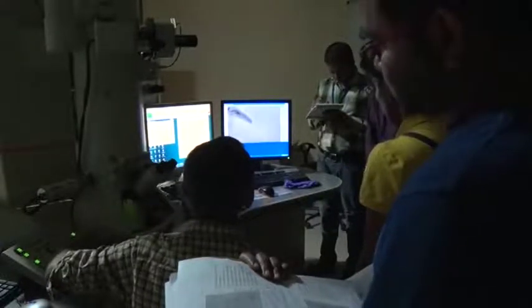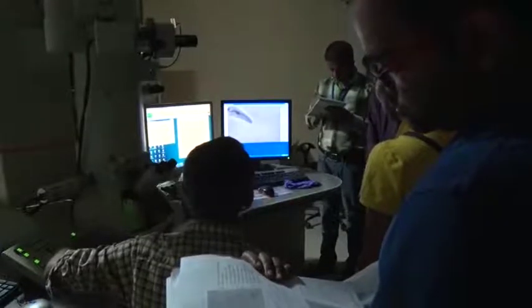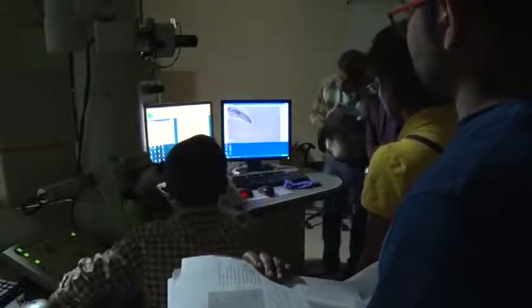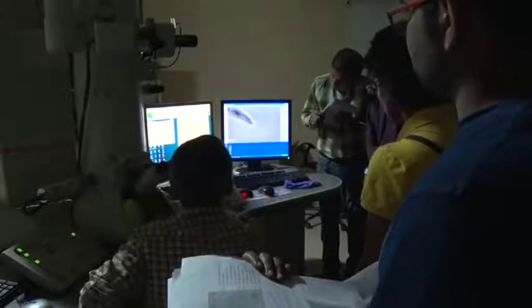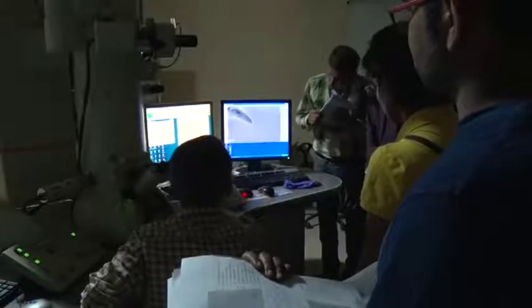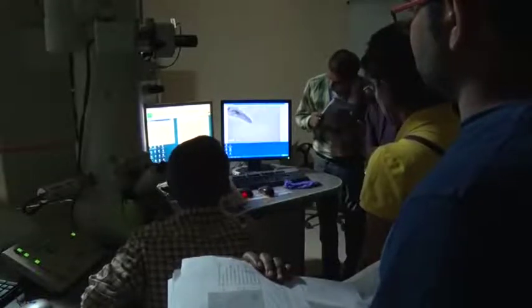So I am trying to correct it. Okay, now I get a feeling that it has started to move in one direction, so I come to the other one and try to make it as minimum as possible. This is probably the wrong direction, so I reverse.